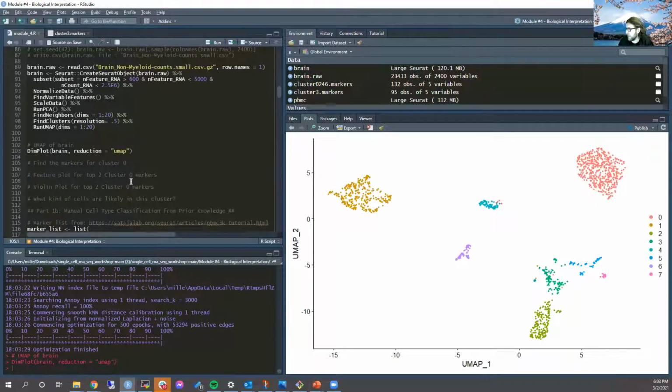I actually don't think there are really any immune cells in this data set. So these will include things like glia and neurons for the most part, and endothelial cells and pericytes and that sort of thing. But I want you to go ahead and take a stab at that. I'm going to give 5 minutes to do this, so let's regroup at 6:10. If you run into questions, do feel free to put those in the chat.